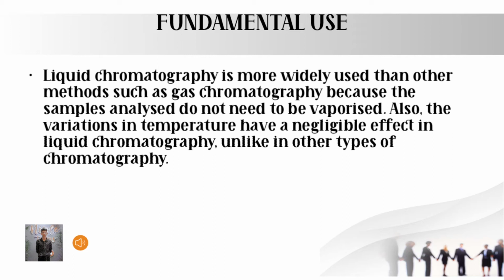Liquid chromatography is more widely used than other methods such as gas chromatography. It is because the samples analyzed do not need to be vaporized. Also, variation in temperature has a negligible effect in liquid chromatography, unlike in other types of chromatography.